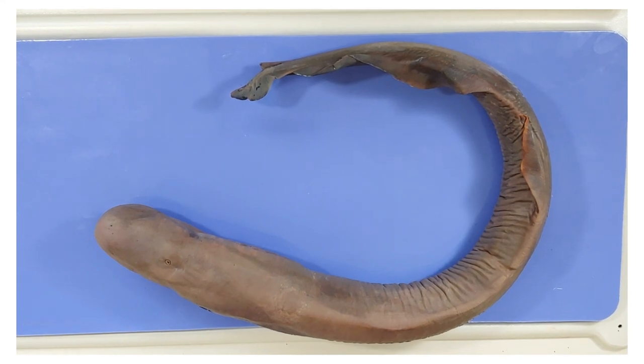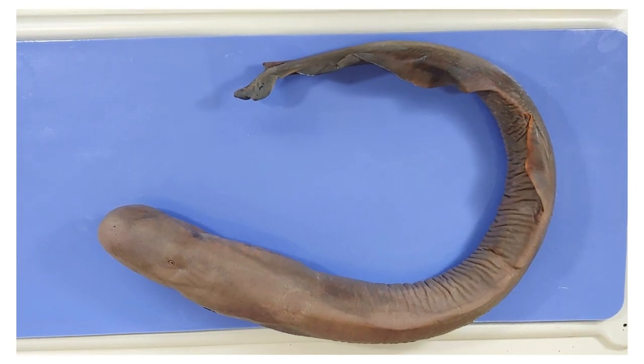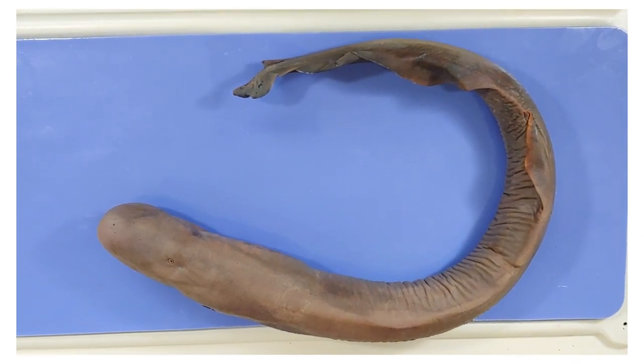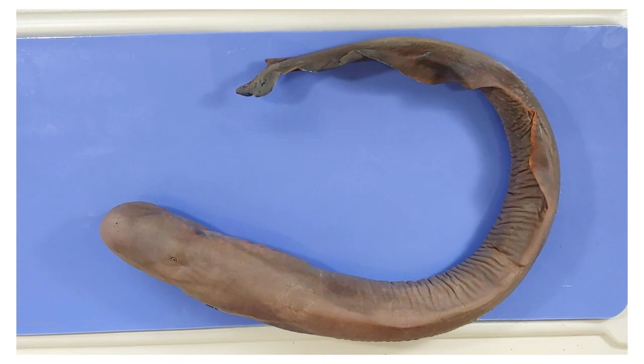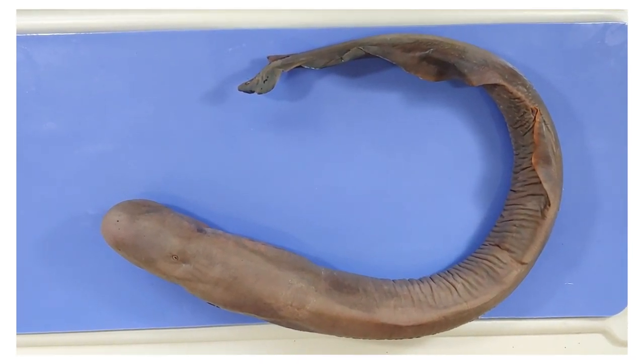So a lamprey is a fish, but it's at the very beginning of the fish lineage — it's the most primitive fish. It has no business looking so bizarre as a fish, but it was actually a fish before all the other fish, so technically they're the most valid fish.